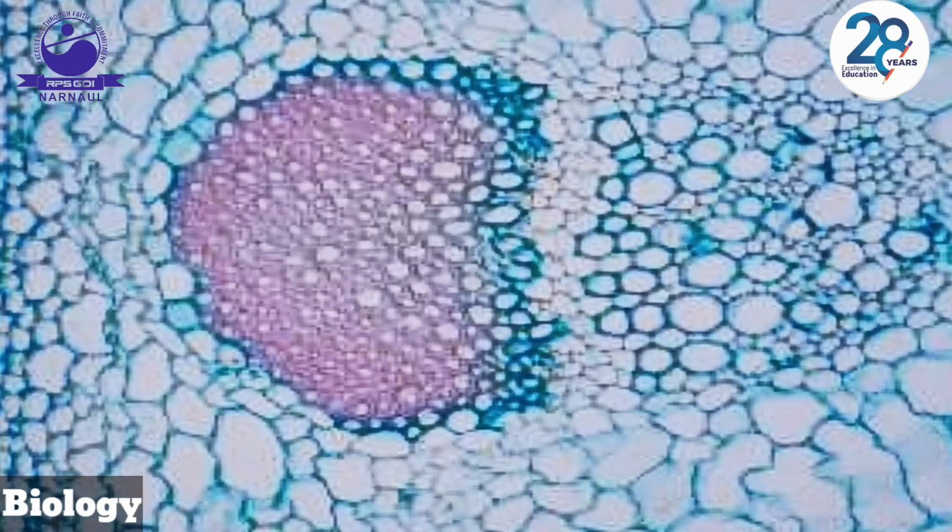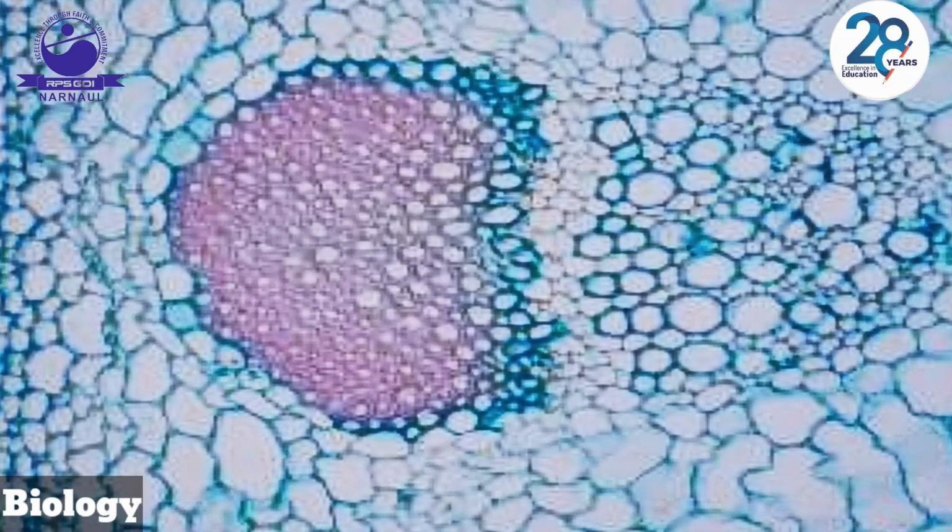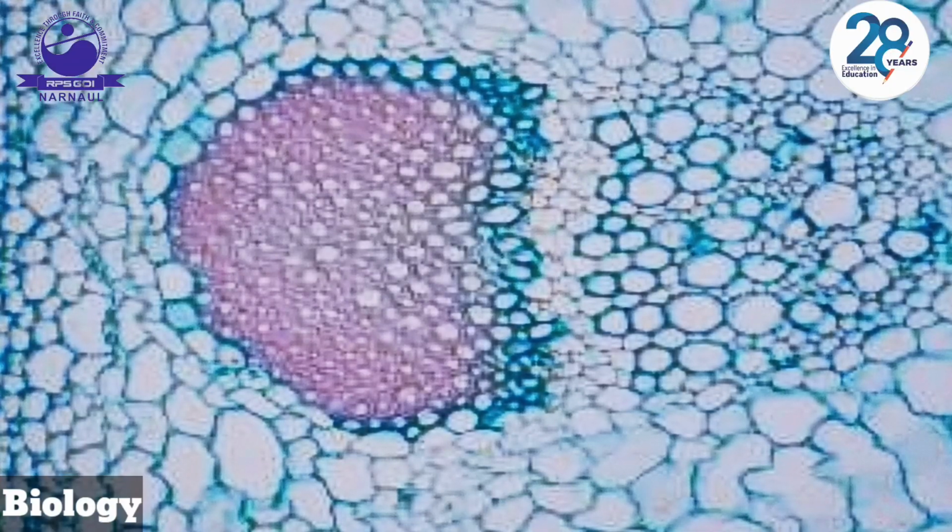Very clear picture, and this picture is of xylem and phloem. On the left side is the xylem and on the right side is the phloem. Xylem consists of tracheal vessels, xylem parenchyma, and xylem fiber. Tracheal vessels and xylem fibers are dead, whereas the parenchyma is living tissue. Xylem provides mechanical support. It is concerned with conduction of water, or we can say cell sap. Xylem is generally located towards the inner side of the plant part.